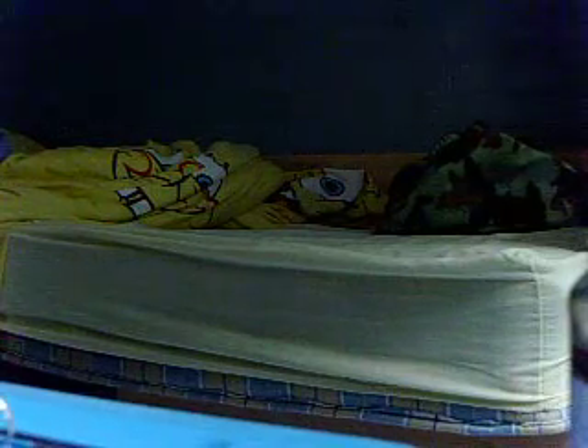So let's get to the thing. Let's just move this and put this iPod — this is where the iPod goes down. It lives there now, just to keep my iPod out of the way. So guys we're back, and this is my lab tools. There's my equipment I guess.